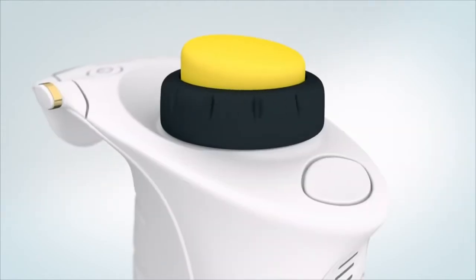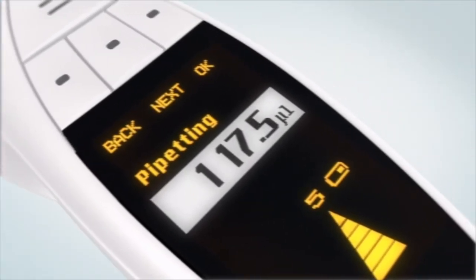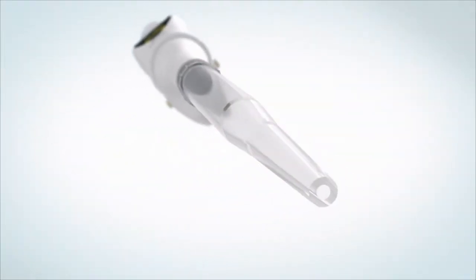We created the pipette from a totally new perspective. We added features never seen before. We've made the PICUS to be as easy to program as possible, still keeping in mind what the pipette is actually used for. It was really easy to program. I learned how to use PICUS in a minute.